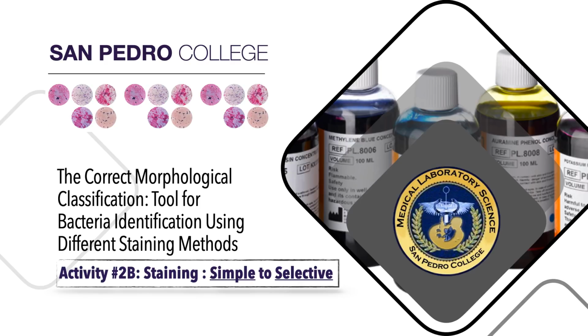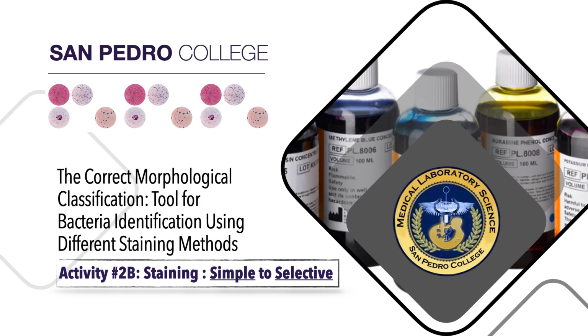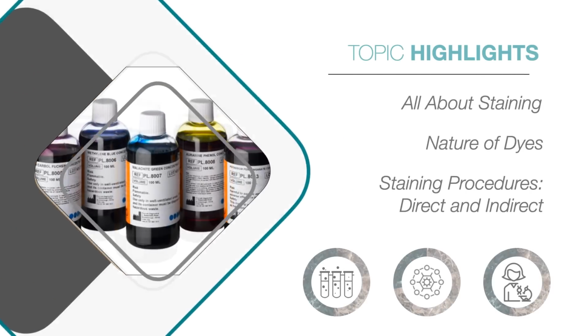But don't worry, even though the bacteria that we will be working with are colorless in nature, we have the stains and the staining procedures that would help us further examine these bacterial structures and the entirety of the bacteria. Now, before we really dig into this topic, here are some topic highlights to guide us along the way.